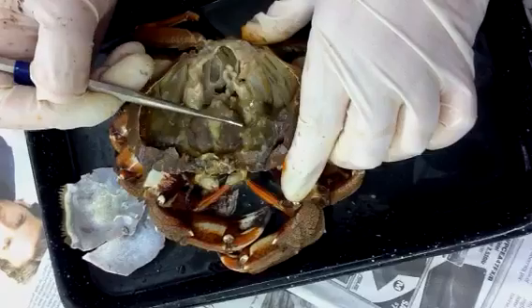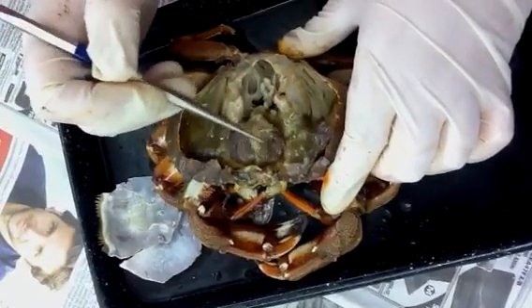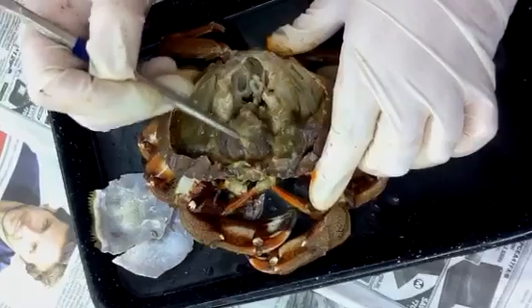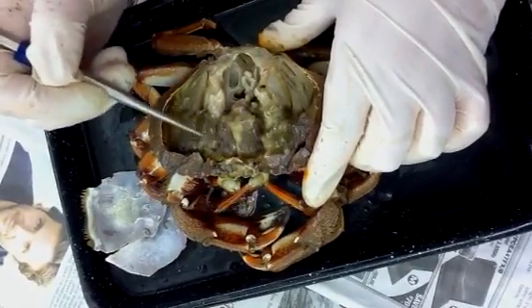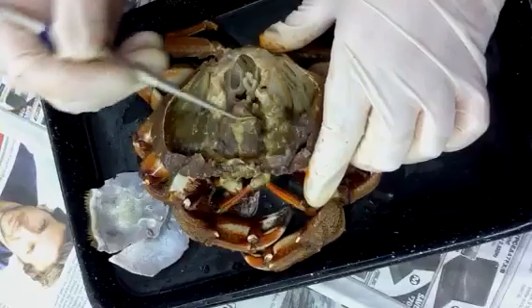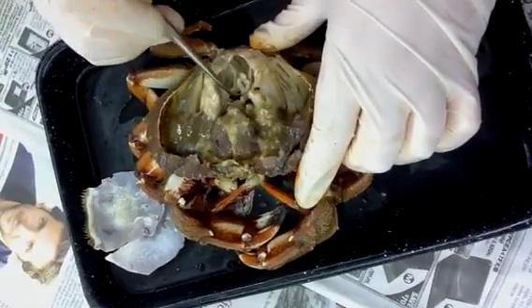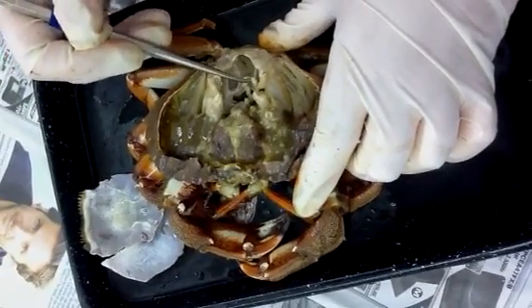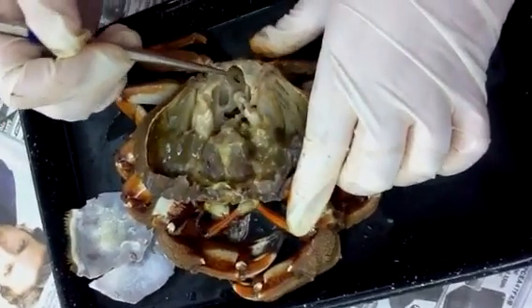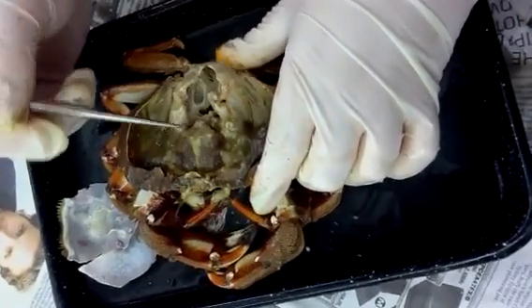This tissue here is gonad — it's spermatozoa that hasn't been produced yet, just immature spermatozoa. And then we have tubules that are bringing it down to more tubules that will deposit the spermatozoa on the modified pleopods that are used for deposition of the spermatozoa in the female.